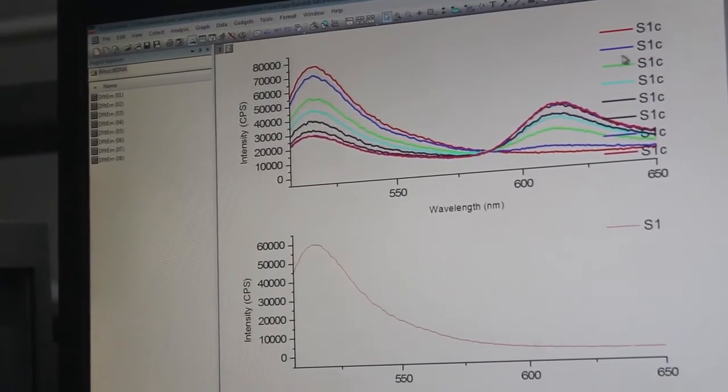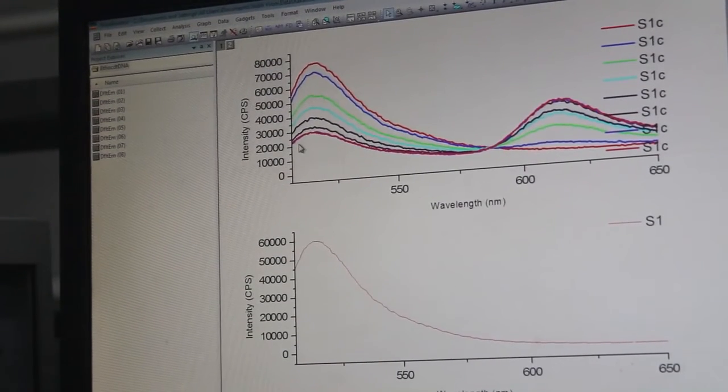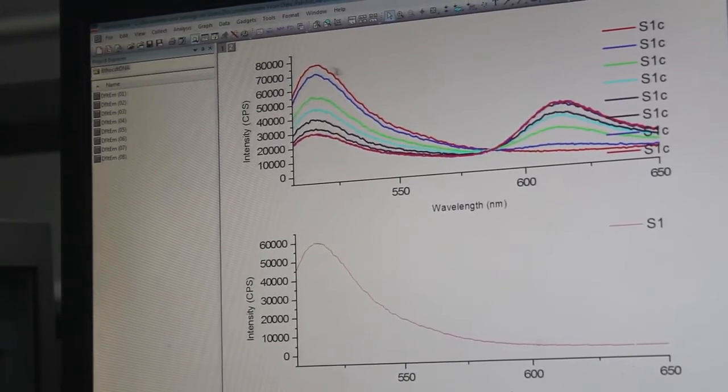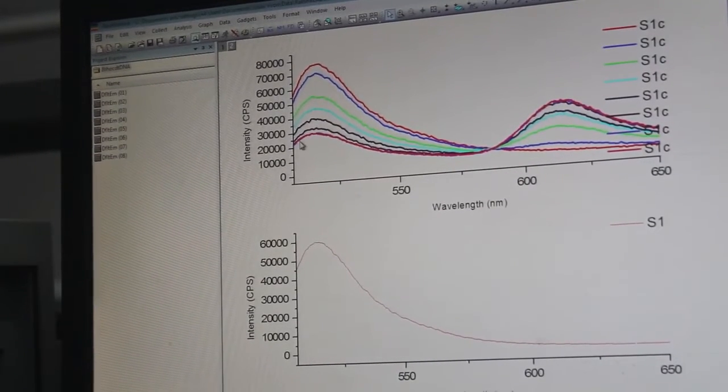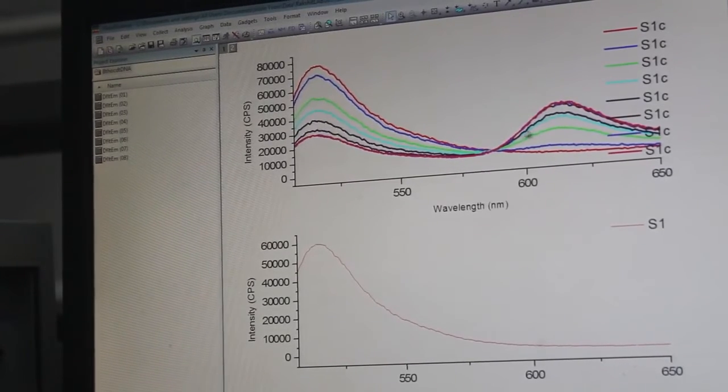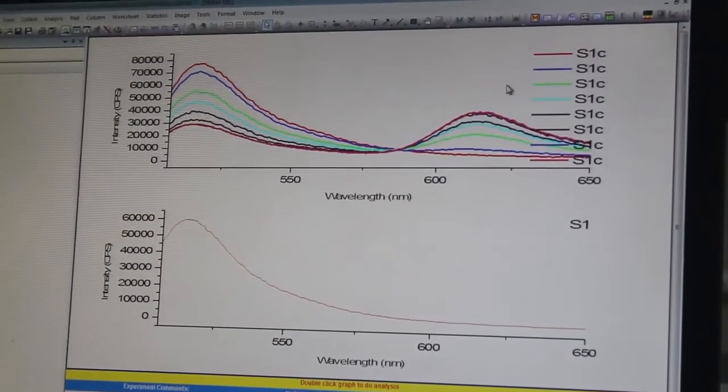From this spectra, we are going to calculate the FRET efficiency from the intensity of the donor when there was no acceptor and comparing with the intensity of the donor in presence of the saturating amount of acceptor. Now our experiment is over.